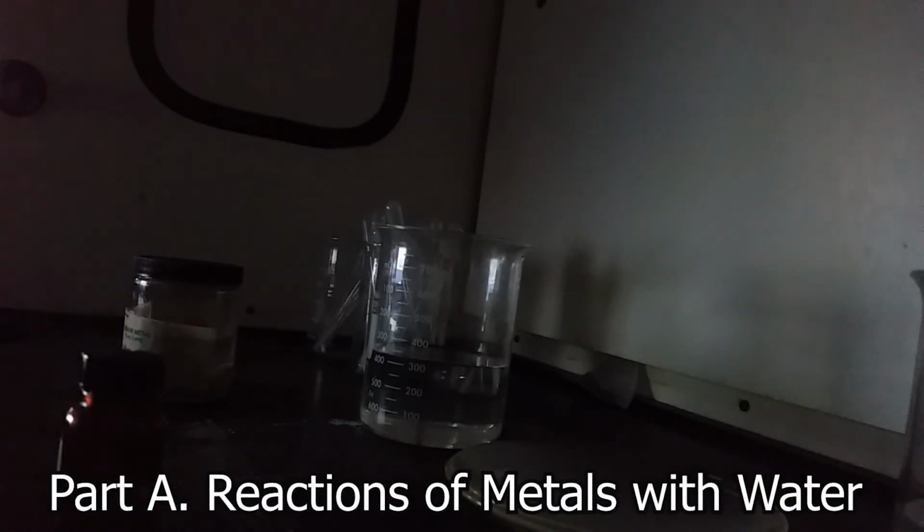All right, this is the sodium-potassium demonstration portion of this laboratory exercise. This is a part that would have been done by our instructor anyway, but because it's included on your lab report and you are asked to comment on your observations, we're going to include it here in this fashion and let you see. So what we're going to start with here is a container that's full of sodium metal.